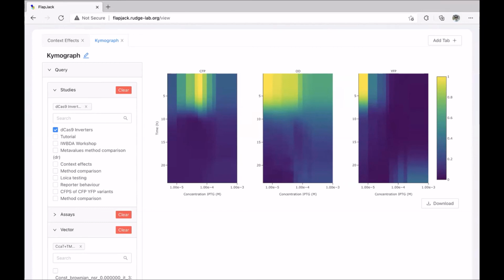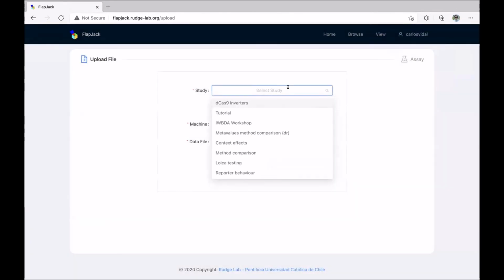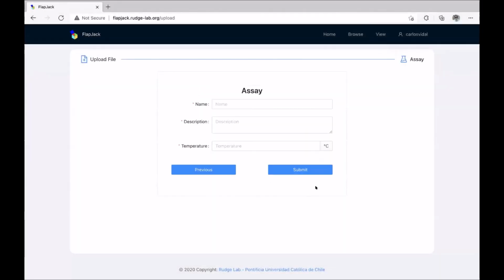Yes, you can. So you can add a description of the signal. So for example, you could put the wavelengths of the filters in the signal. You can also do kind of aesthetic things like choose the color of the signal. So when it's plotted, for example, GFP will be green. So at the moment it's left fairly open, that you have a description where you can specify information that you like, because different types of signals will have different types of information that you want to add.